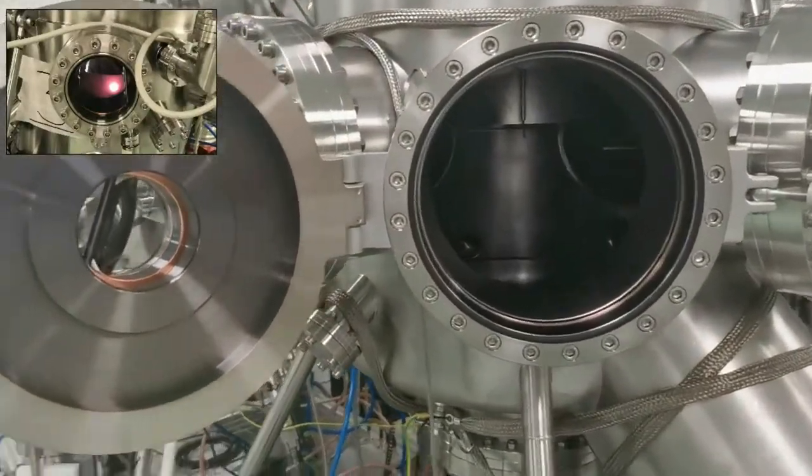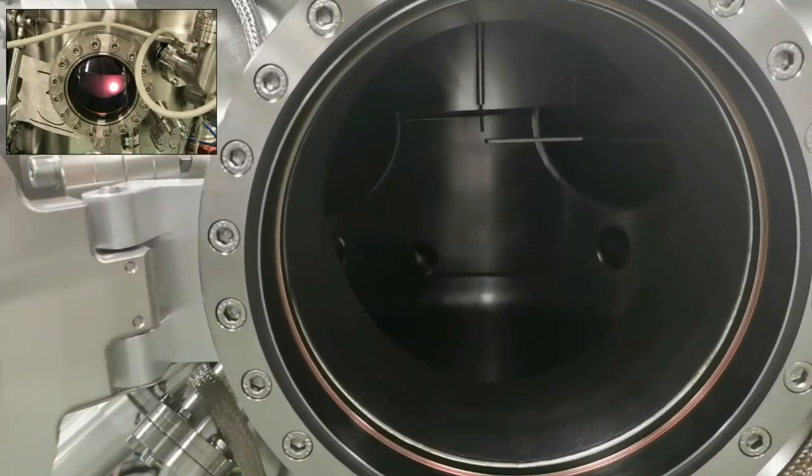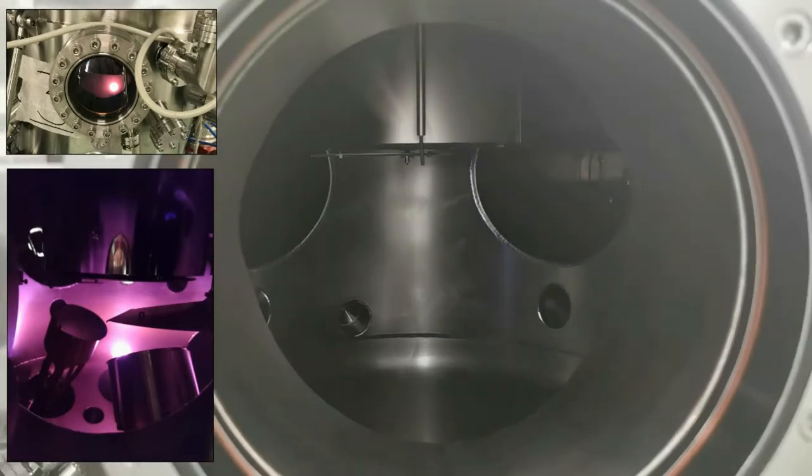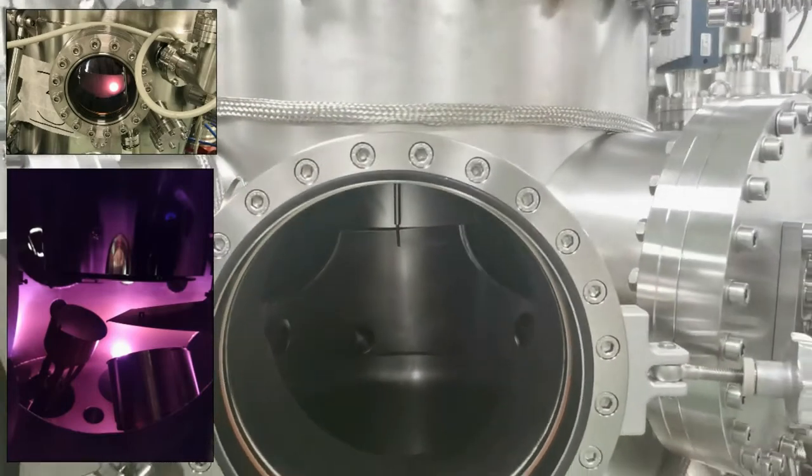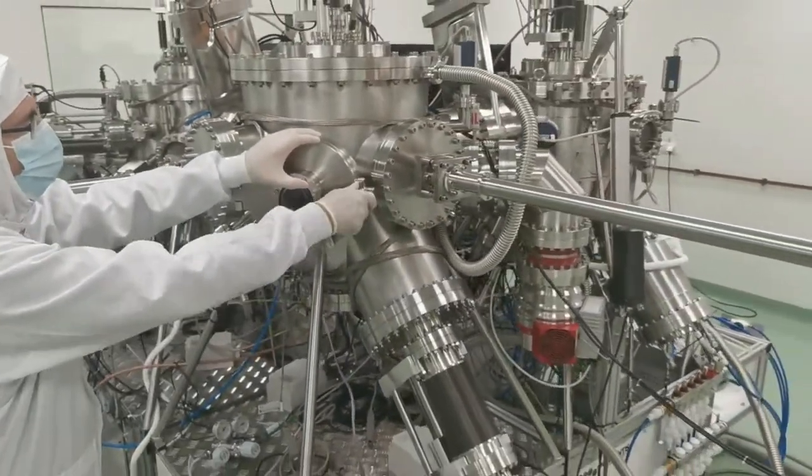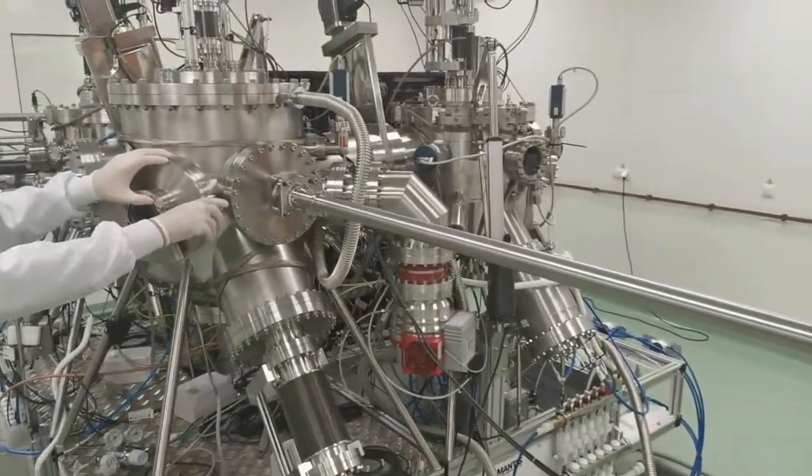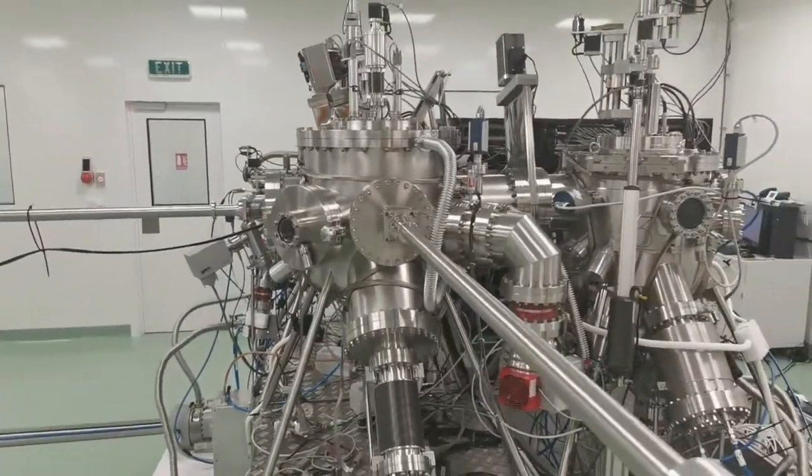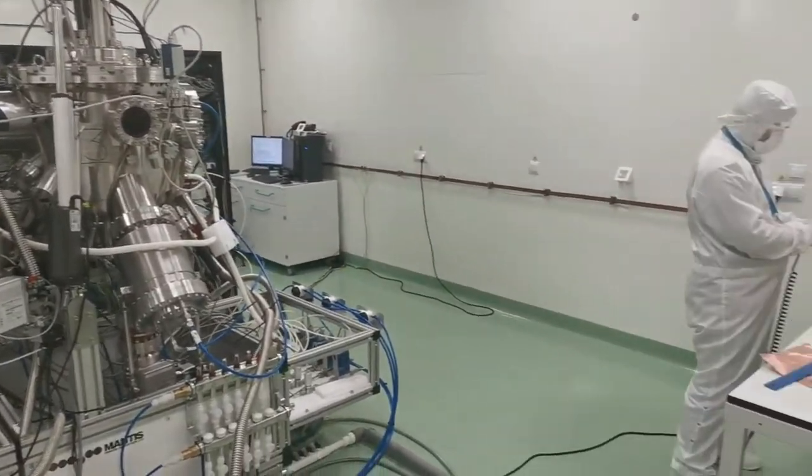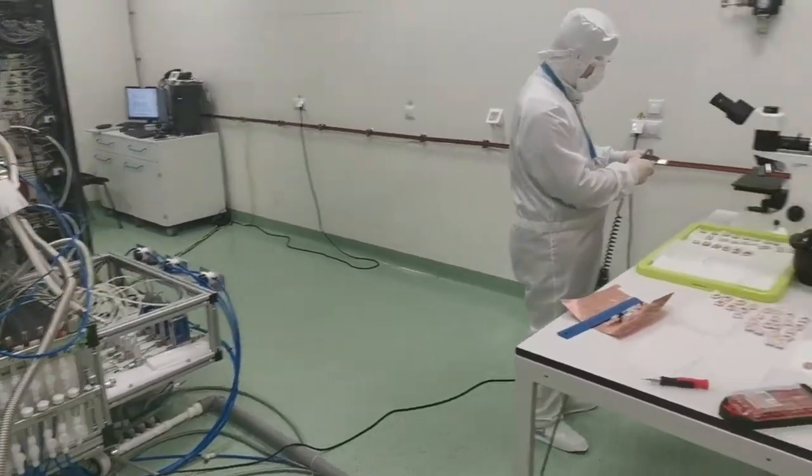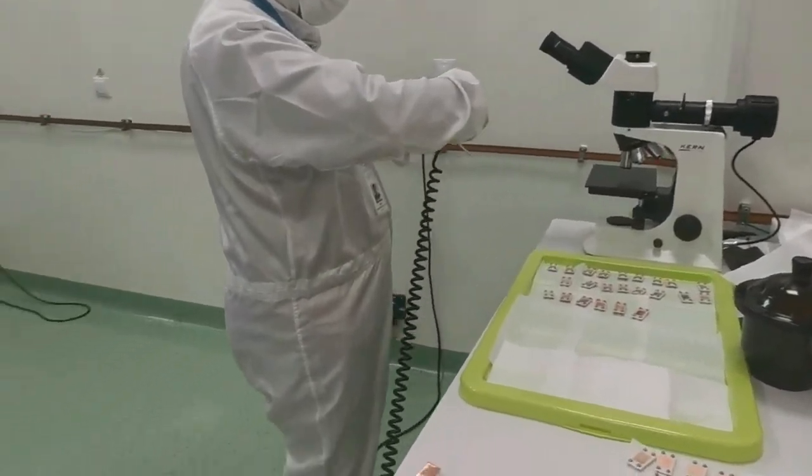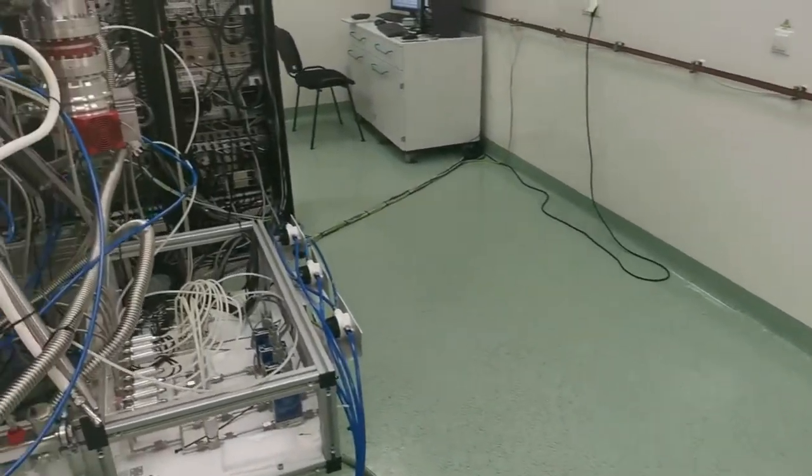This tool's main features include a vacuum chamber dedicated to oxide deposition with four RF or DC magnetrons and a mass spectrometer, a second vacuum chamber for metal and nitride deposition equipped with six RF or DC magnetrons, a nanogen unit for nanoparticle deposition down to 13 nanometers, and the final load lock for in-situ sample transfer between the process chamber and for the argon ion and milling process with rotating and tilting capabilities.